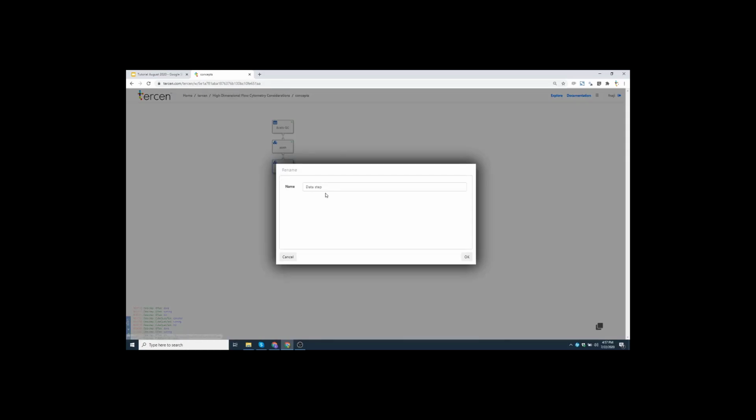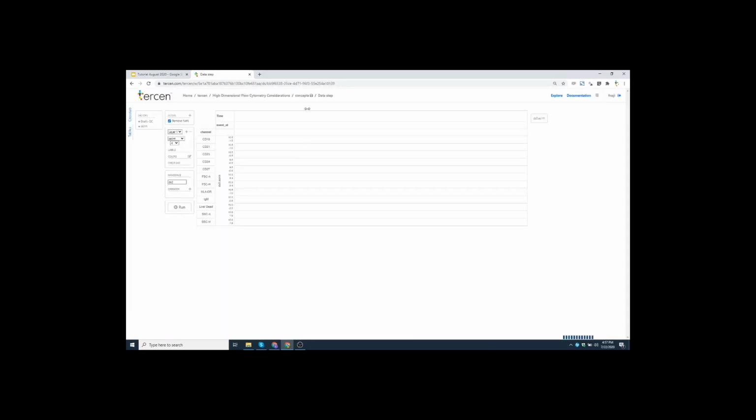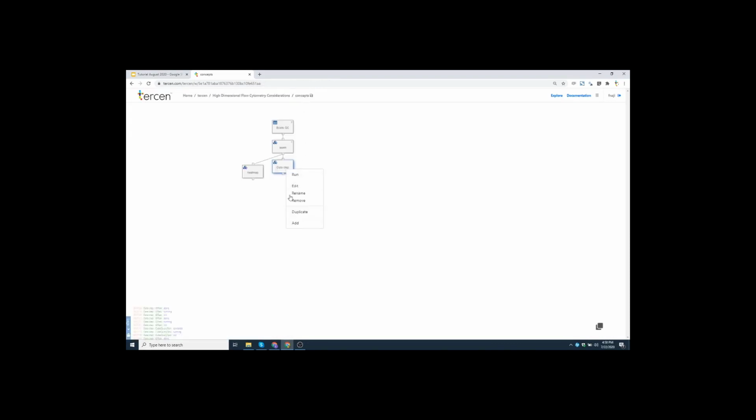So we've performed a transformation, but you can basically go on, and I'll just rename this to a heat map maybe, but you can also perform a clustering, a dimension reduction. You can keep adding steps to perform different functions, and you can make projections and add new steps, and you can build up steps.